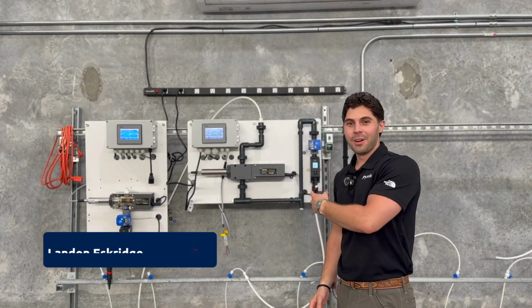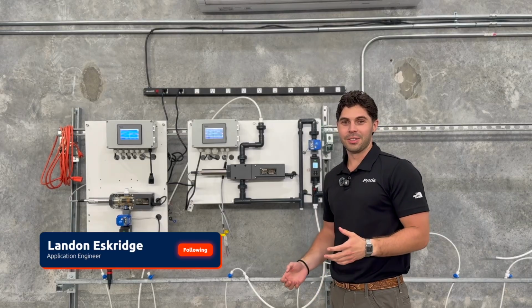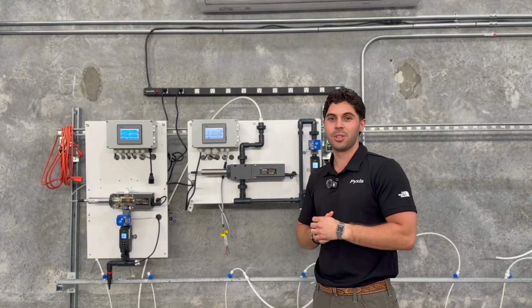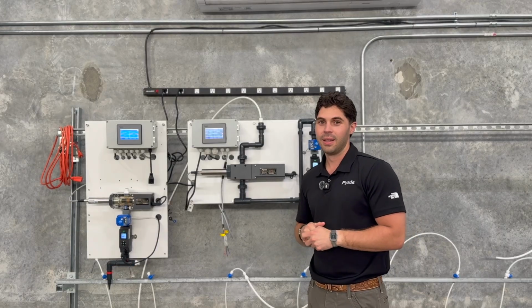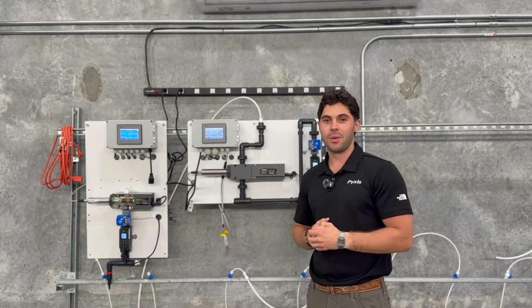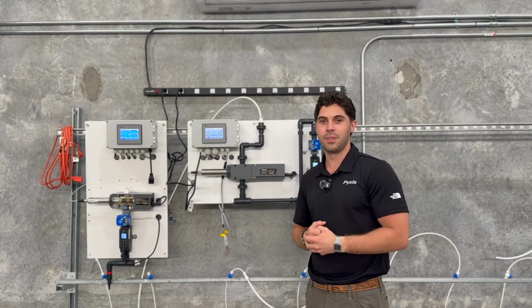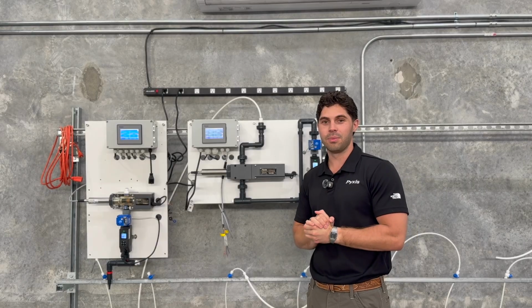If you're using one of our OXIPANELs or other analyzers in the field, it most likely incorporates a UC-80 human-machine interface digital display. Since I got you here, I'm going to show you how to utilize the different components built within so that way you're equipped in the field to manage your unit properly.